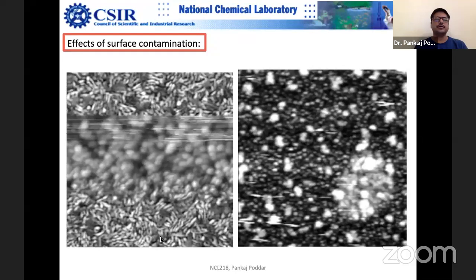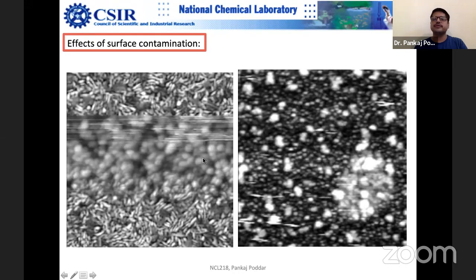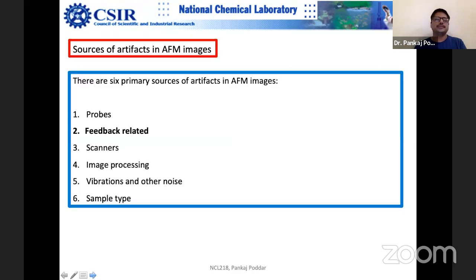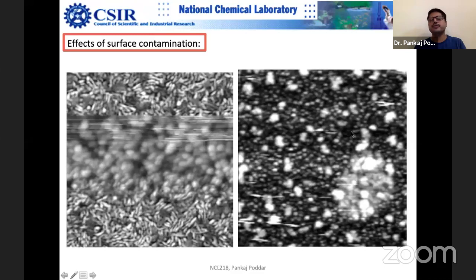After some time you go back to normal images. You got a nice image, then contamination appeared, then you got rid of the contamination and came back to original quality. You can also see streaks in images — this is very common. If you capture 10 images, perhaps 5 will have this problem. This is especially common in contact mode; tapping mode has fewer chances of contamination because there is less direct contact.